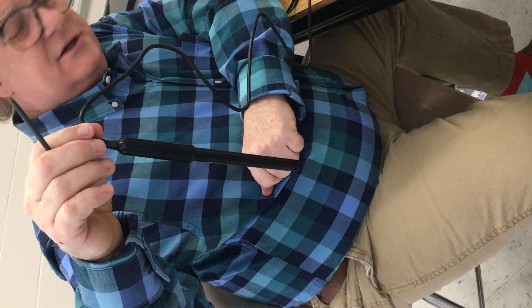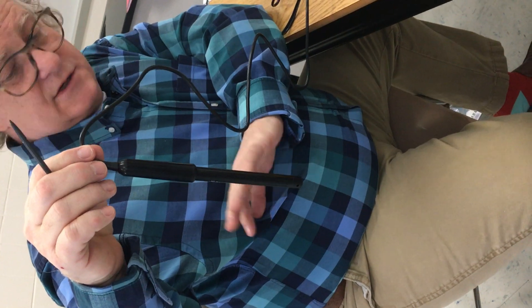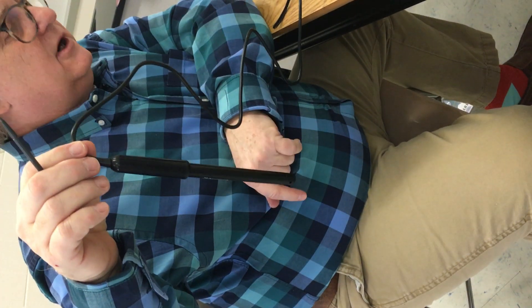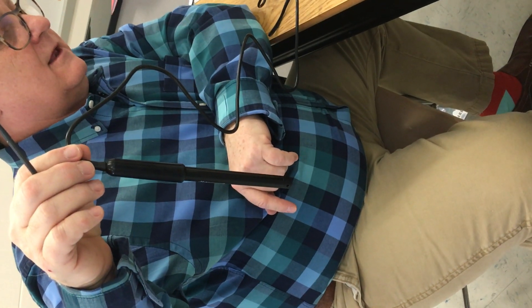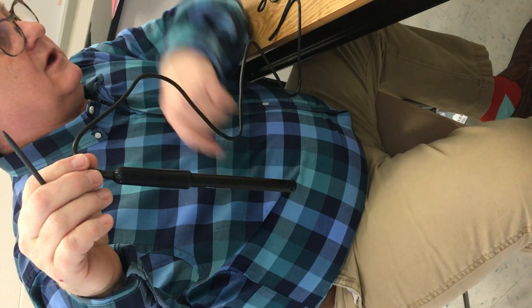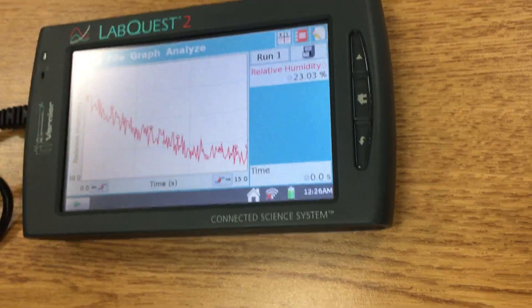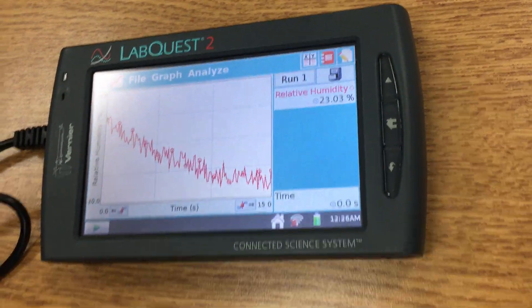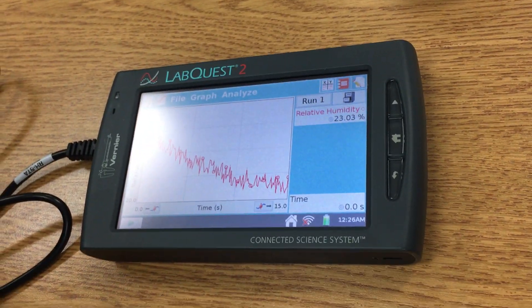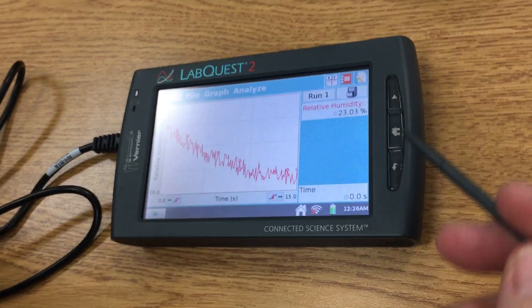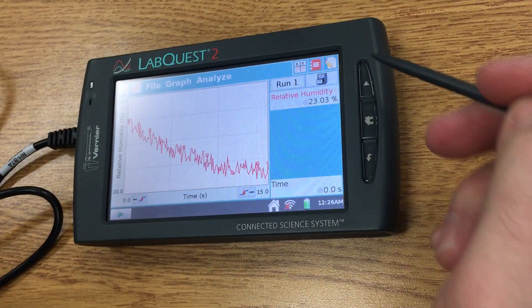When it's done, it gives you this graph right here. Notice that graph slides down. We're going to take another one.